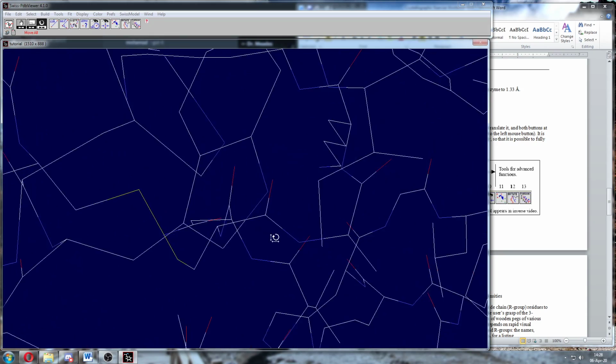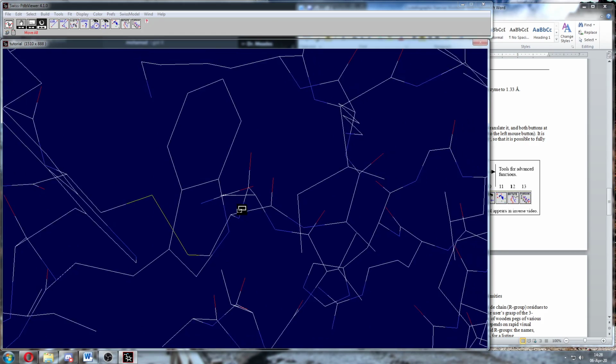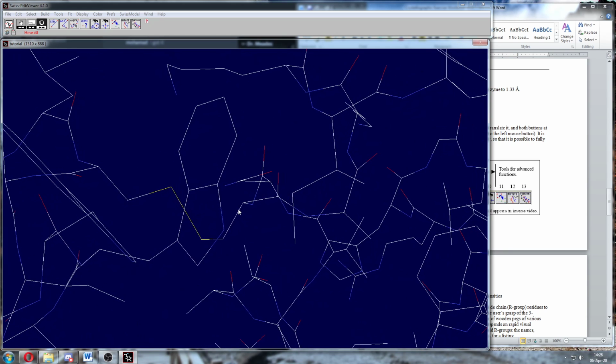Right, so that tryptophan right there. Everybody see its 2 rings? It's kind of at an angle to us right now, but you can see it's 2 rings. We'll get a better view of one in a minute. But this part, as you know, in tryptophan, is a benzene ring, an aromatic ring. I'd like to find out how far it is across this ring.